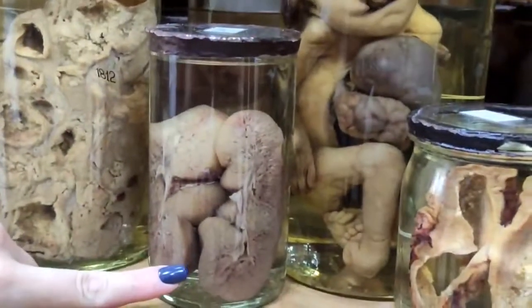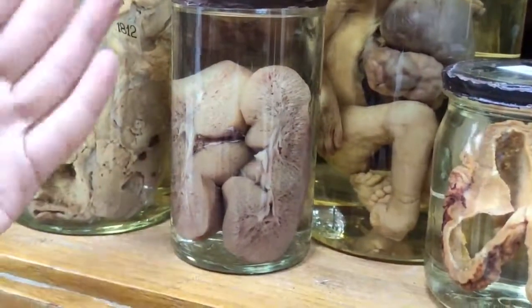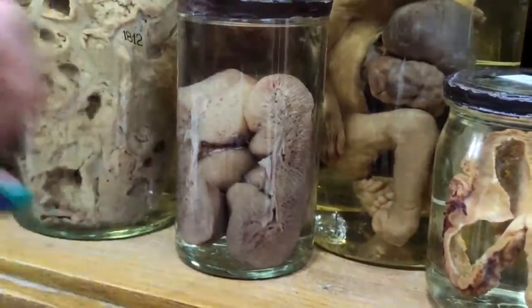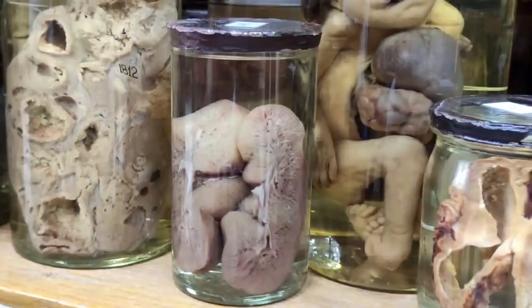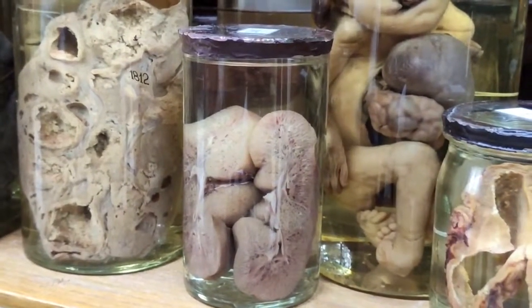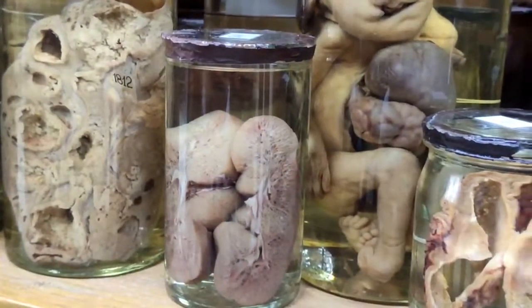The next one is polycystic kidney disease, and you can see that this kidney is gutted and opened, and you can see that it consists of multiple cysts, because this is an inherited condition when the patient has cystic transformation of the collecting system of the kidney, and we can see a lot of these elements here.